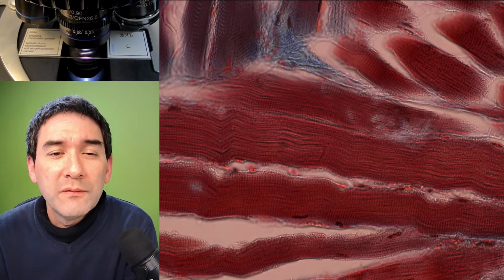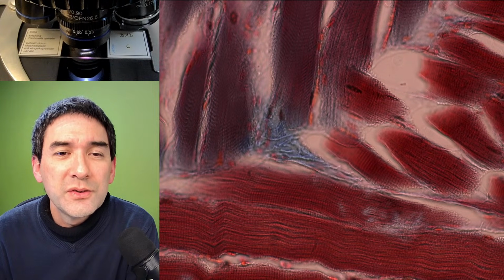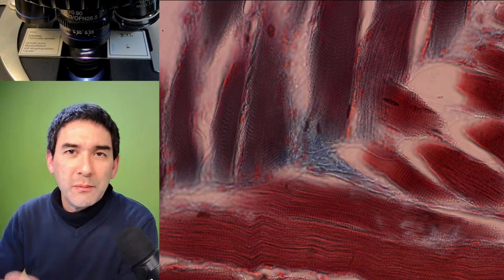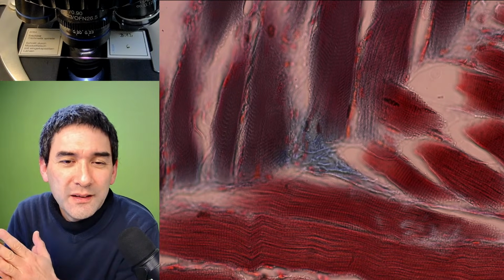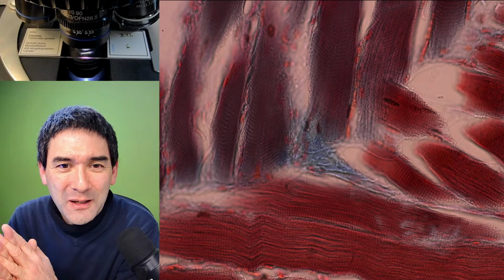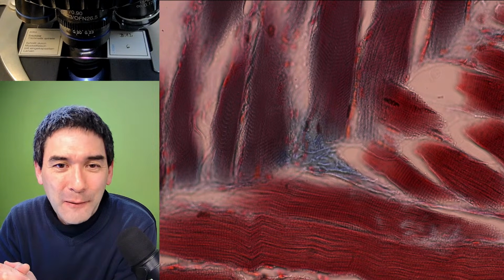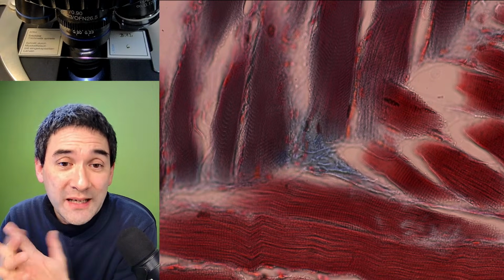So, if you are very careful, and I know that I've been mentioning this already before, also in other live streams and videos, if you look very carefully, then you're able to see that those muscle fibers have those fine stripes. They're called striations. And those striations are actually a little bit like a test of how good your microscope is. Those striations are called the light and the dark bands. My students have to know this for their biology exams, and they're very typical of so-called striated muscles.